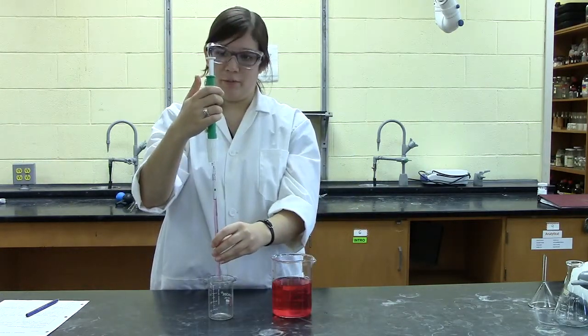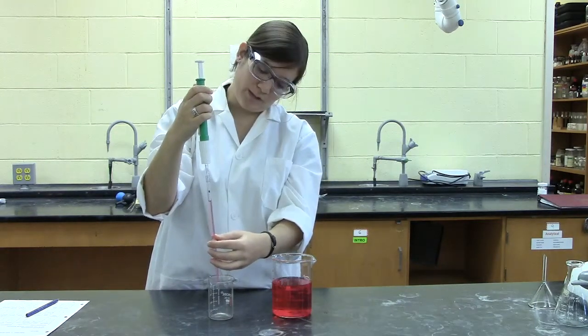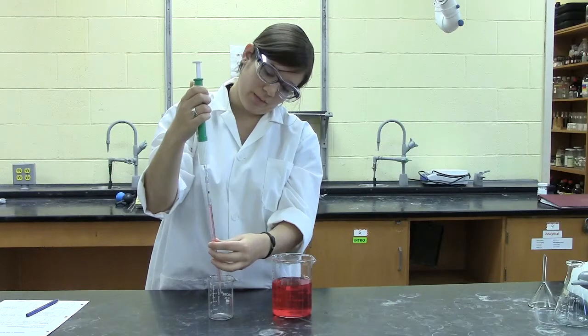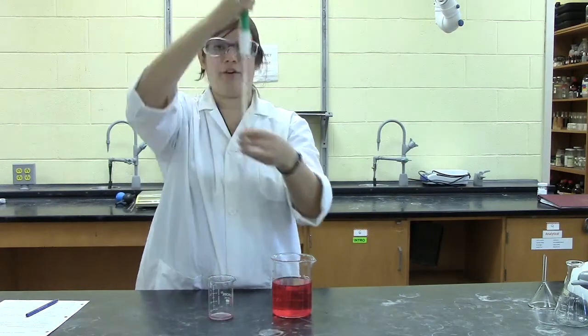Once you have it leveled to the zero mark, if you want to add, say, two milliliters, you can just use the wheel in the opposite direction to lower the meniscus down to the two milliliter mark. And that's your correct volume.